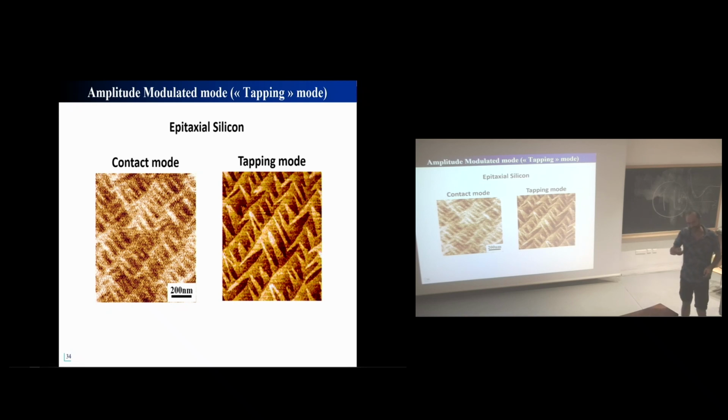I remember that. So you mentioned that we have a piezo at the end of the cantilever, that we apply the AC voltage to, right? Yeah. And the frequency of this AC voltage should be lower than the resonance frequency. But is it the resonance frequency or the free amplitude? No, the excitation frequency has to be smaller than the resonance frequency. But if this is your free amplitude, of course the set point, meaning the amplitude used to probe the surface, is smaller because you want to interact.